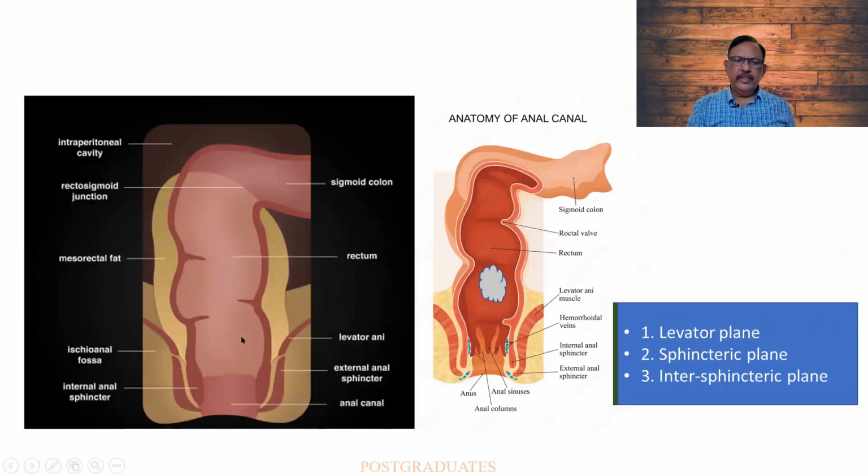The normal structures. One thing that I should be having in mind will be the sphincters, rather the surgeon. He is very particular about it because if the sphincter and the levator ani muscles are being cut, they won't be functioning and the bowel will lose its continence. And there is a tumor over here. When they do a surgery, they have got all this in mind, and we should be able to cope up with that.